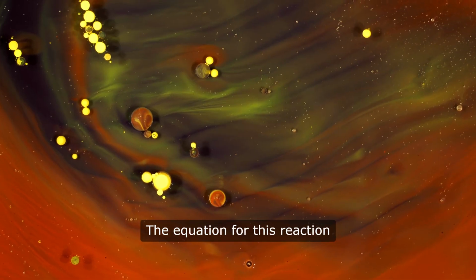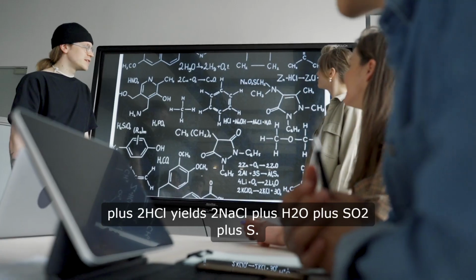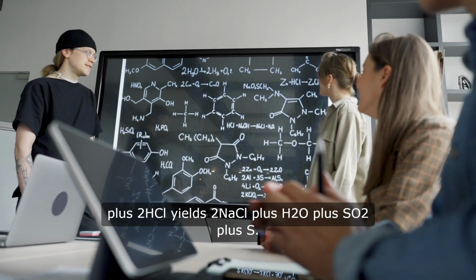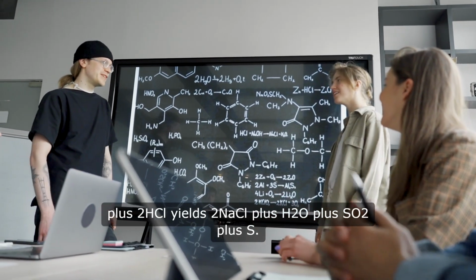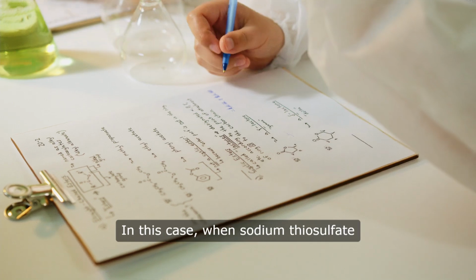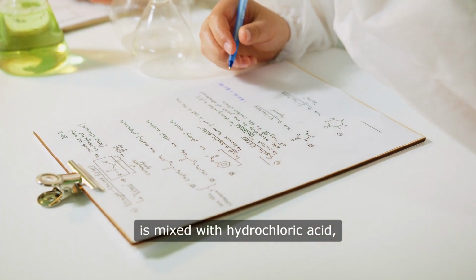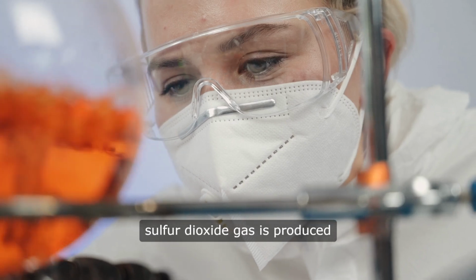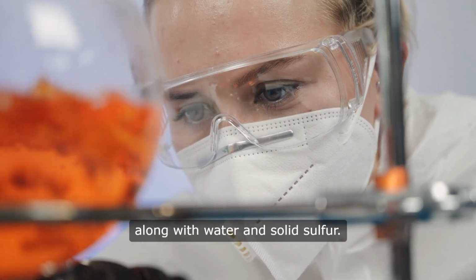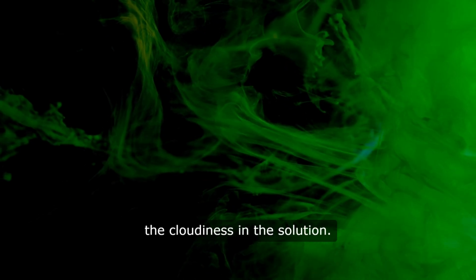The equation for this reaction can be written as Na2S2O3 + 2HCl → 2NaCl + H2O + SO2 + S. In this case, when sodium thiosulfate is mixed with hydrochloric acid, sulfur dioxide gas is produced along with water and solid sulfur. The solid sulfur is what causes the cloudiness in the solution.